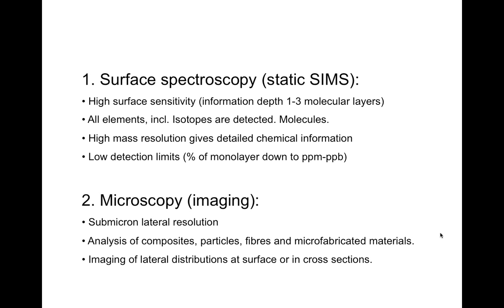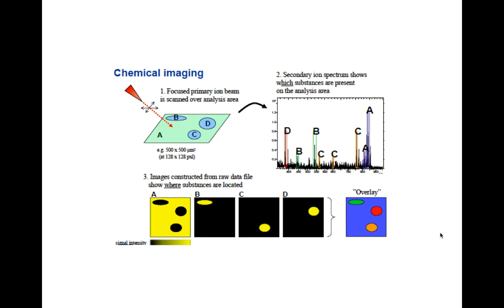We can also have imaging, and then we have a submicron lateral resolution. We can analyze composites, particles, fibers, and microfabricated materials.